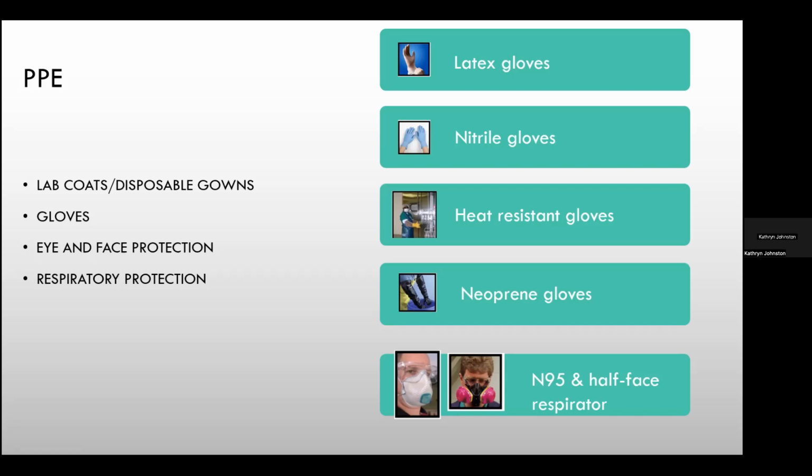What are some recommendations about the selection of that? Well, first of all, the length. Lab coats should be at least knee length or longer for the most effective coverage. The lab coat should have a fitted wristband or cuff, and that reduces the potential for splashes up the arm as well as for fire hazards. It should have a top button, and that top button should be closed, and that is to provide the most effective protection. And then it should be fire resistant.